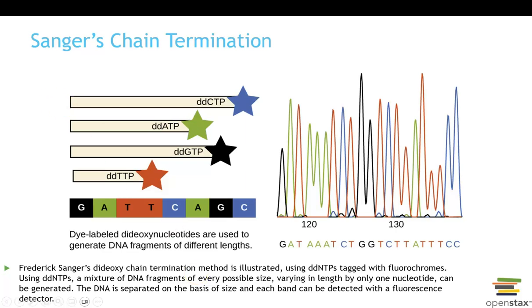So I want to talk about one of the first techniques that we use in DNA sequencing. They call it Sanger chain termination. So by using these ddNTPs, these specific kinds of nucleotides, these scientists were able to sequence the DNA, and so we could figure out the order of the nucleotides in the DNA or genomic DNA of that microorganism.